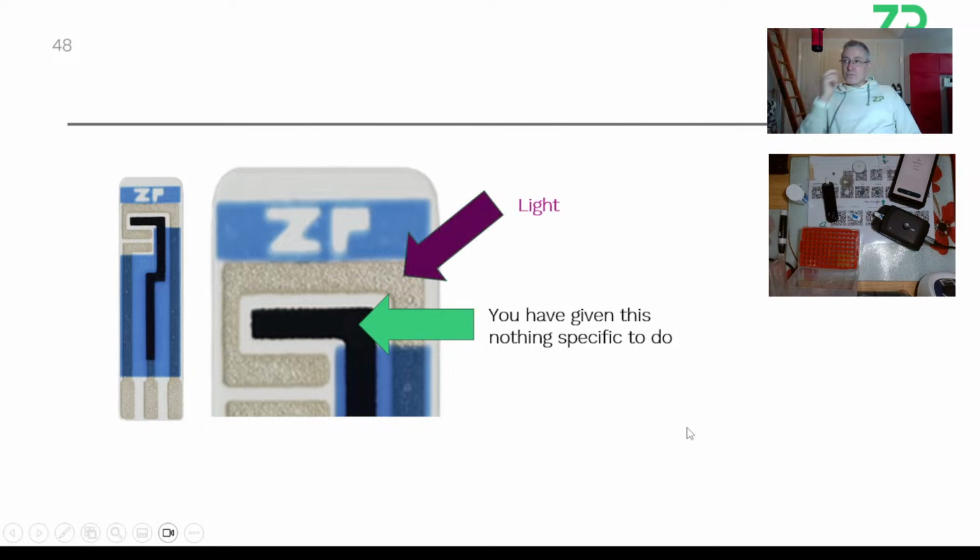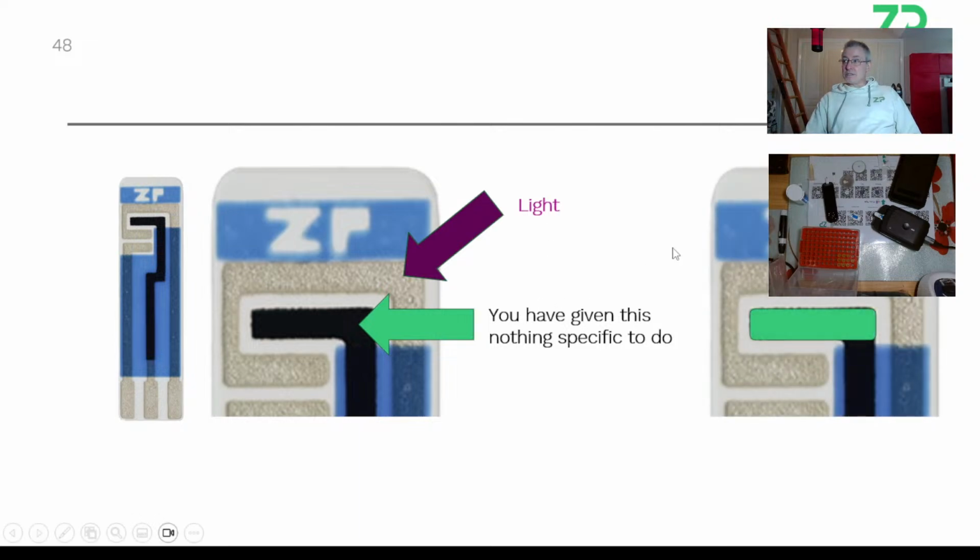It's also probably worth just knowing that if this is sitting in light for several days, silver chloride, most silver and silver ions are light sensitive, so just be aware of that.